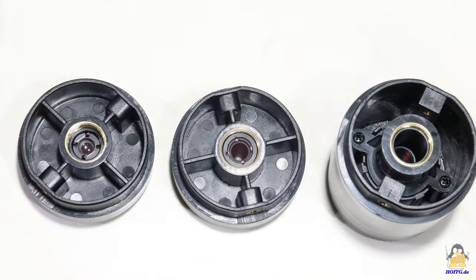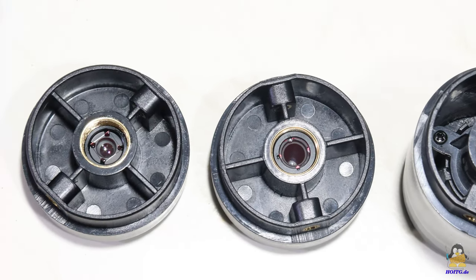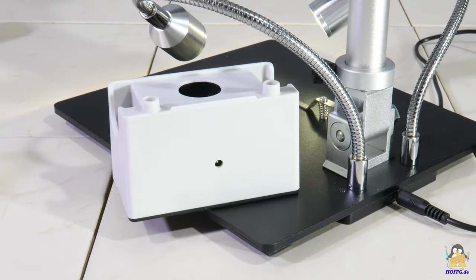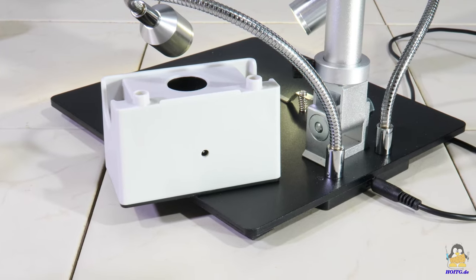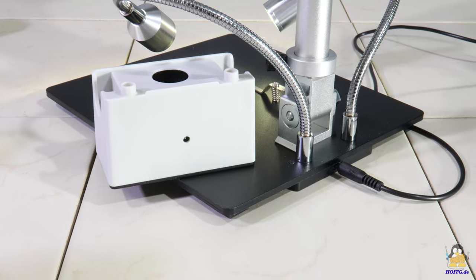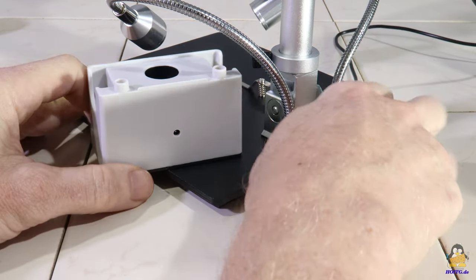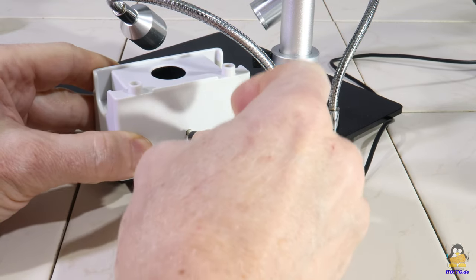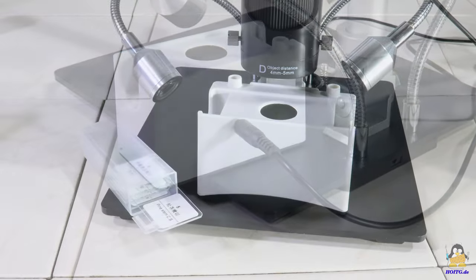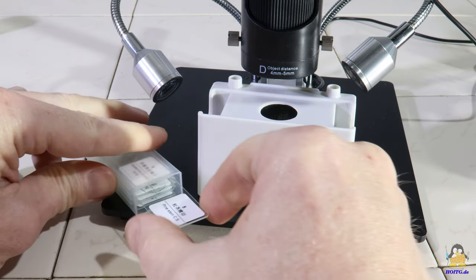The third lens is designed for a small object distance of only 4 to 5mm. With such small gaps illuminating from above or from the side is nearly impossible, so the transmittive light source is needed now. In order to get this LED powered, the plug must be disconnected from the reflected light source and plugged into the transmitted light box. That light box works best on transparent objects.